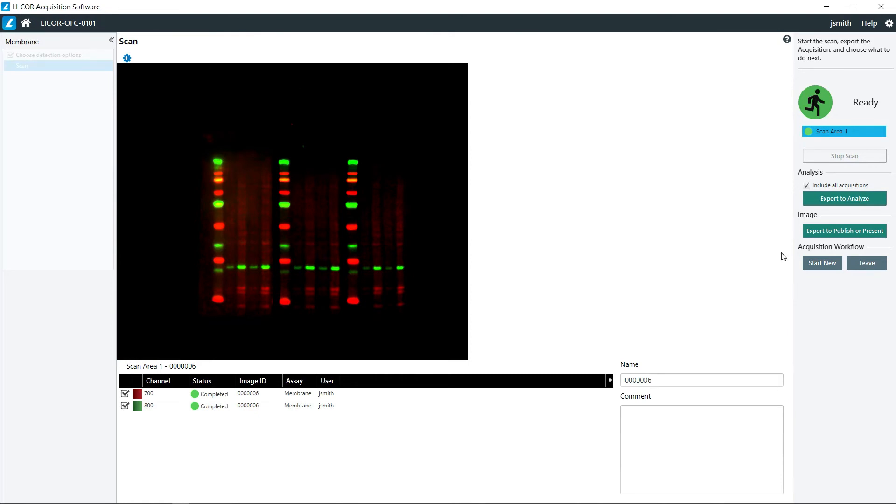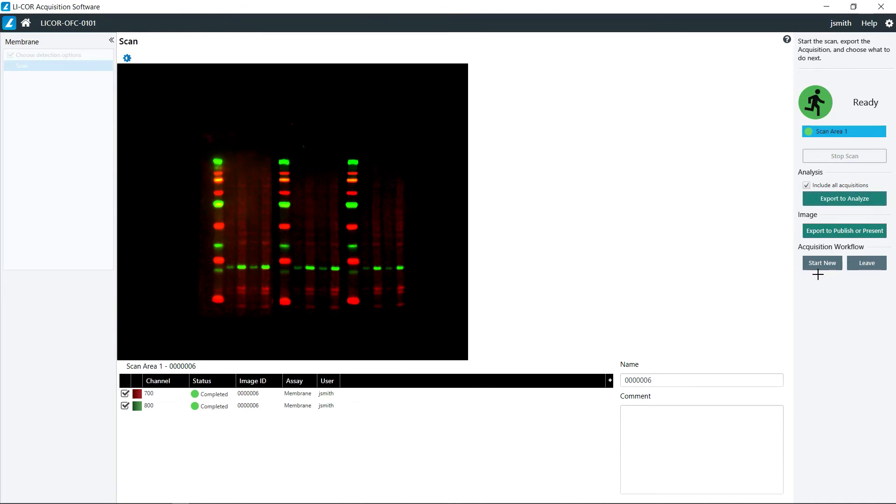This has completed, so you would then click export for analysis, and if you have other membranes that you wish to analyze, click start new, otherwise click leave to return to the main menu.